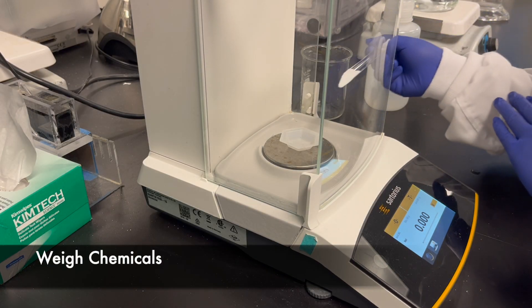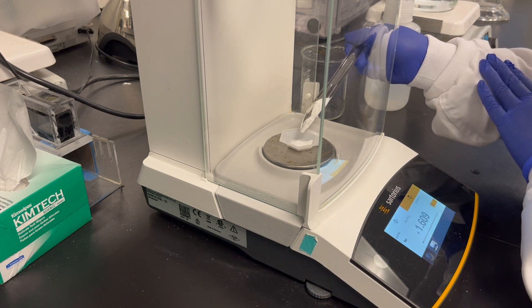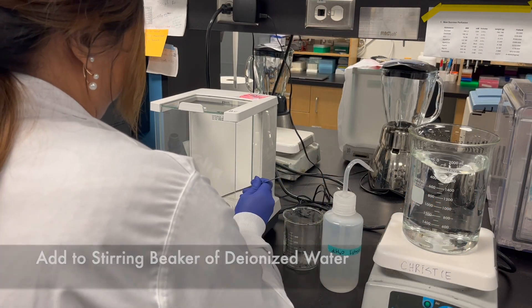Crystal will begin by weighing the solutes on the weigh boat. To confirm that our solution is accurate, we use a scale that measures to the third decimal place. The solutes are then poured into a beaker of deionized water.